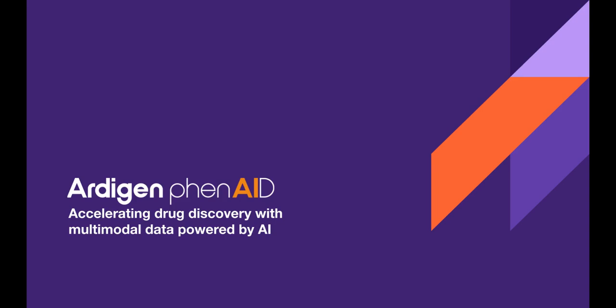In this demo, I'll show you Ardigen phenAID, a web platform for drug discovery. It is a tool that empowers biologists to unlock the full potential of high-content screening campaigns, leverage complex multimodal data for deeper insight, and accelerate drug discovery through an intuitive, user-friendly, and data-driven solution.